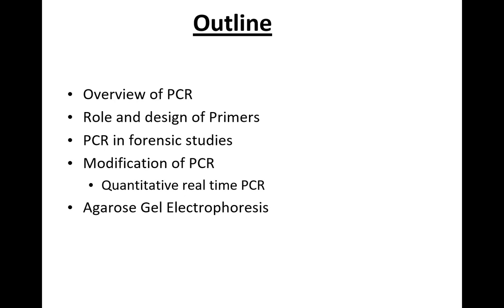Then we'll talk about how PCR has been modified through time, focusing particularly on one technique, which is quantitative real-time PCR, which is used pretty much anywhere now in all labs. I'm pretty sure that the day you start working, most likely you will run into that or you will have to perform that. So we'll touch on the theory of quantitative real-time PCR as well. And then in the end, I'll just finish up refreshing some concepts about agarose gel electrophoresis, how it works and how it can be used to visualize DNA molecules and to estimate their size.